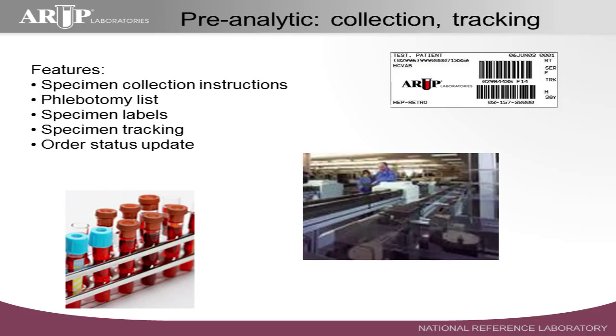So you have to have in your LIS the functions to create phlebotomy lists. That's basically their to-do list, right? I have to go to this floor and this nursing station and that floor and this to draw from these patients. And since the phlebotomists usually report up through the laboratory, this function or feature is found in the LIS. And so all that information is pre-established.